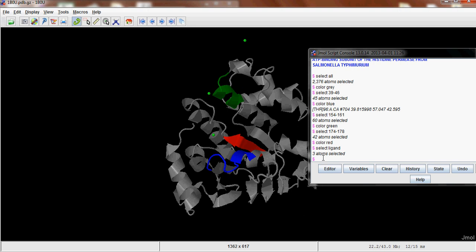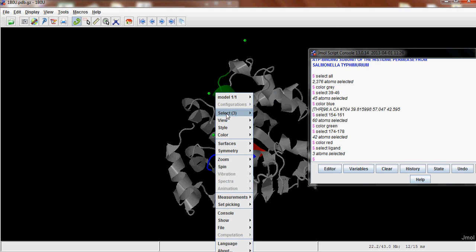The next thing you need to do is find where all the aspartates are and then show which atom in one of these aspartates is closest to the nearest atom in motif A. I know it's a bit confusing the way it's described on the website, but just do exactly as I do. So right click on the screen in the Select menu, go into Protein, By Residue Name, and then go into Aspartate.